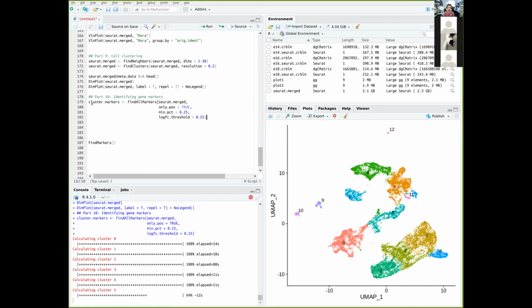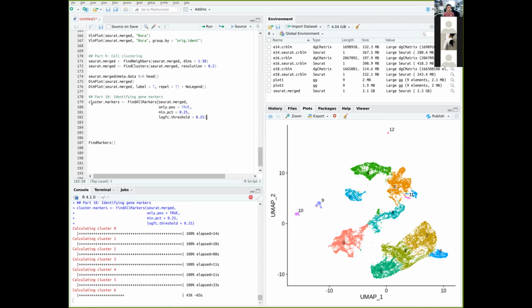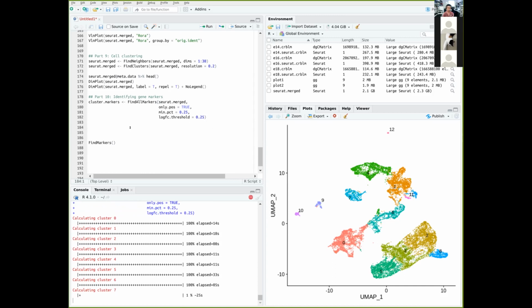Right? It does take a bit of practice. I would say that I'm not the best at this as well. I do make mistakes sometimes of using the wrong parameters and have to do it again and again and again. But that's the whole point. You iterate the whole thing to refine your list, and hopefully the list has a decent size, a decent confident gene set that you can actually use for validation or downstream analysis.